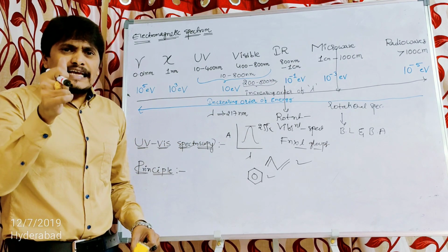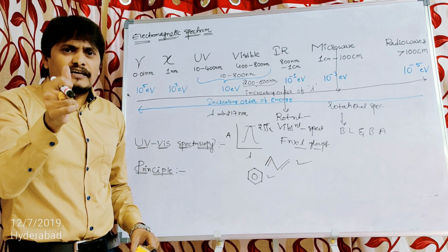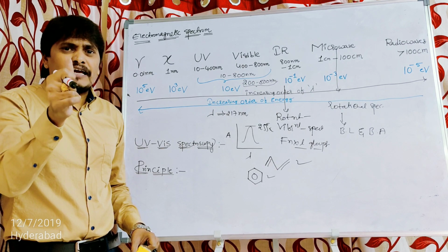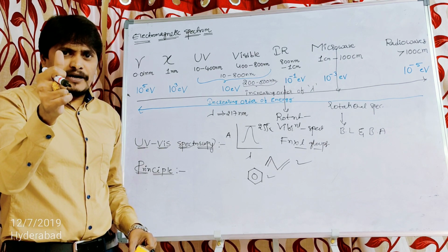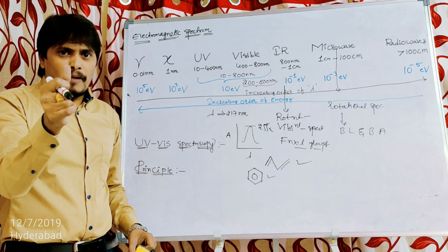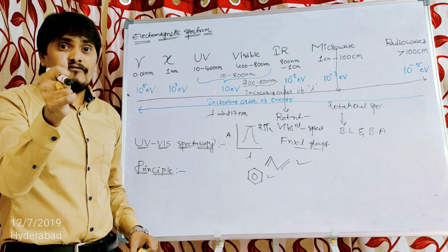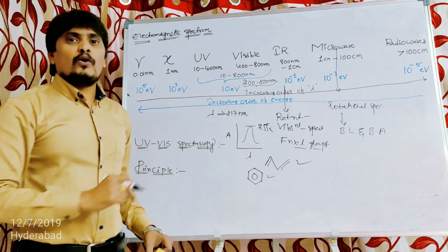And do remember that each and every molecule absorbs at one particular wavelength only. It is the fingerprint for each and every molecule. Just like our fingerprint is unique, the lambda max, that is the wavelength maximally absorbed by the molecule, is unique for each and every molecule. I hope you understood this particular concept, students.